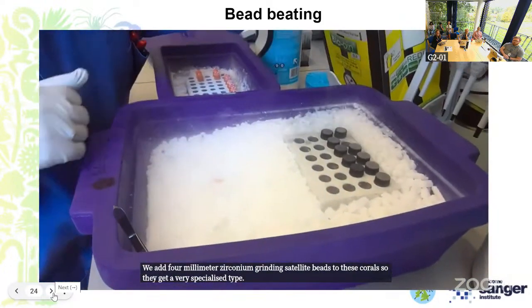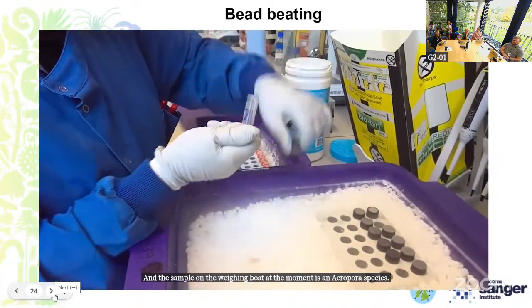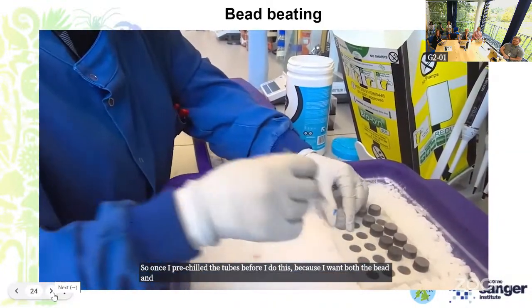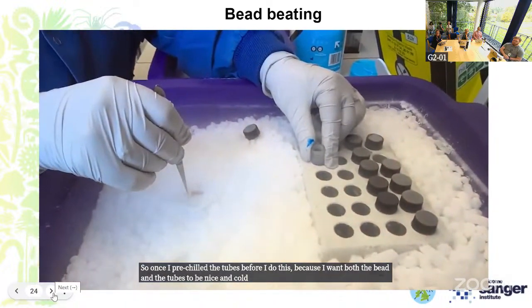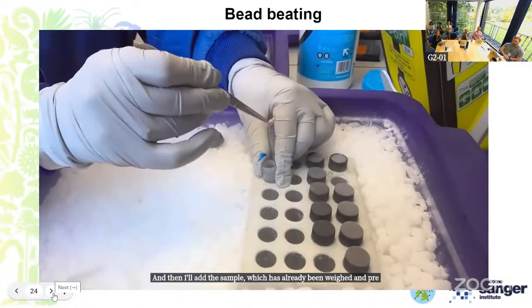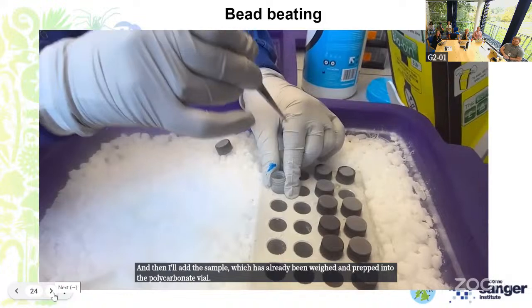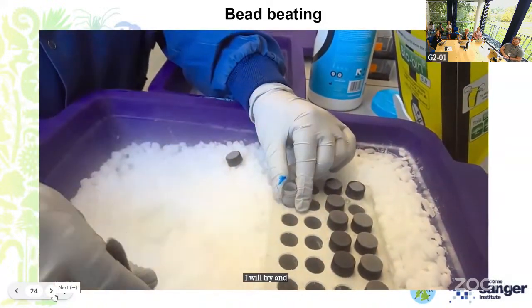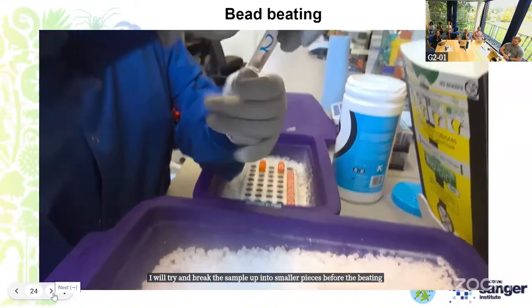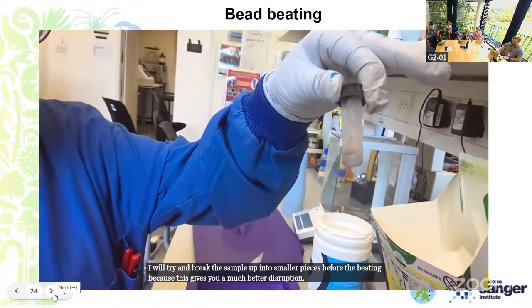The sample on the weighing boat at the moment is an Acropora species. I pre-chill the tubes before I do this, because I want both the bead and the tubes to be nice and cold. Then I'll add the sample, which has already been weighed and prepped, into the polycarbonate vial. I will try and break the sample up into smaller pieces before bead beating, because this gives you a much better disruption and pulverization of your sample.